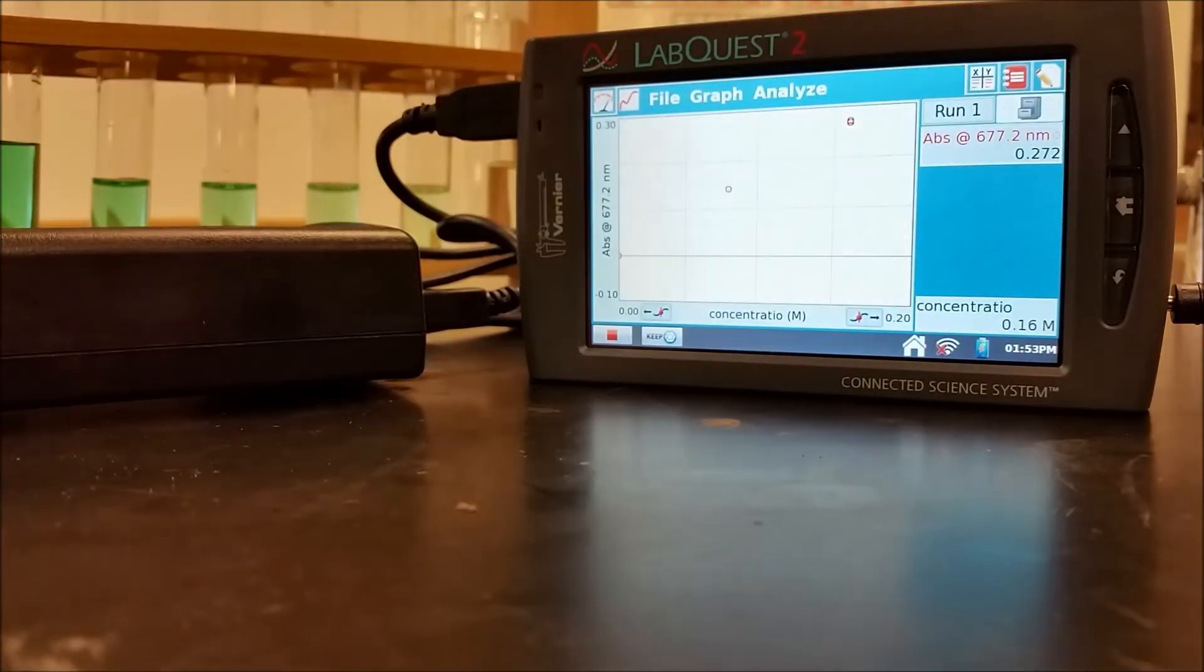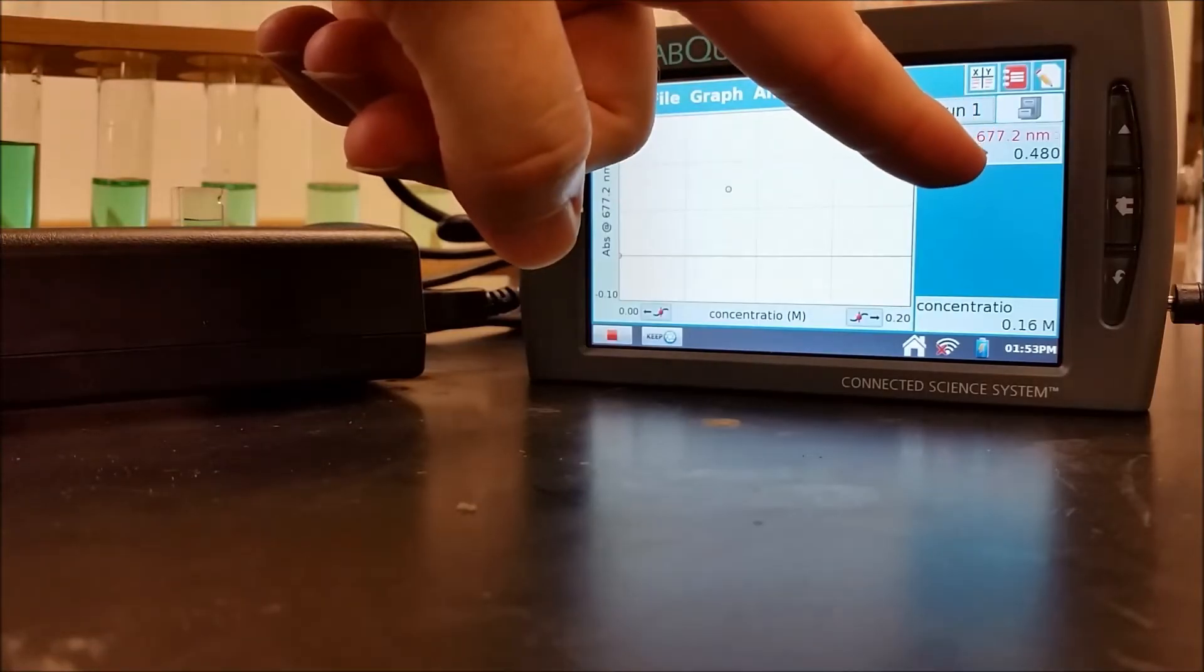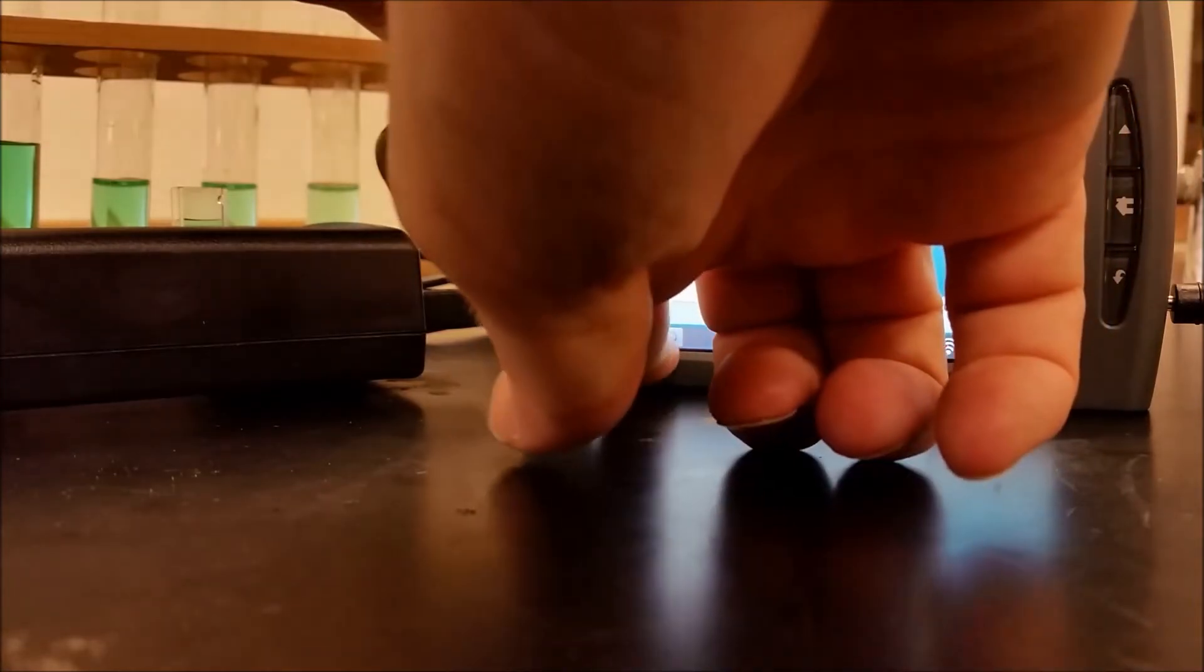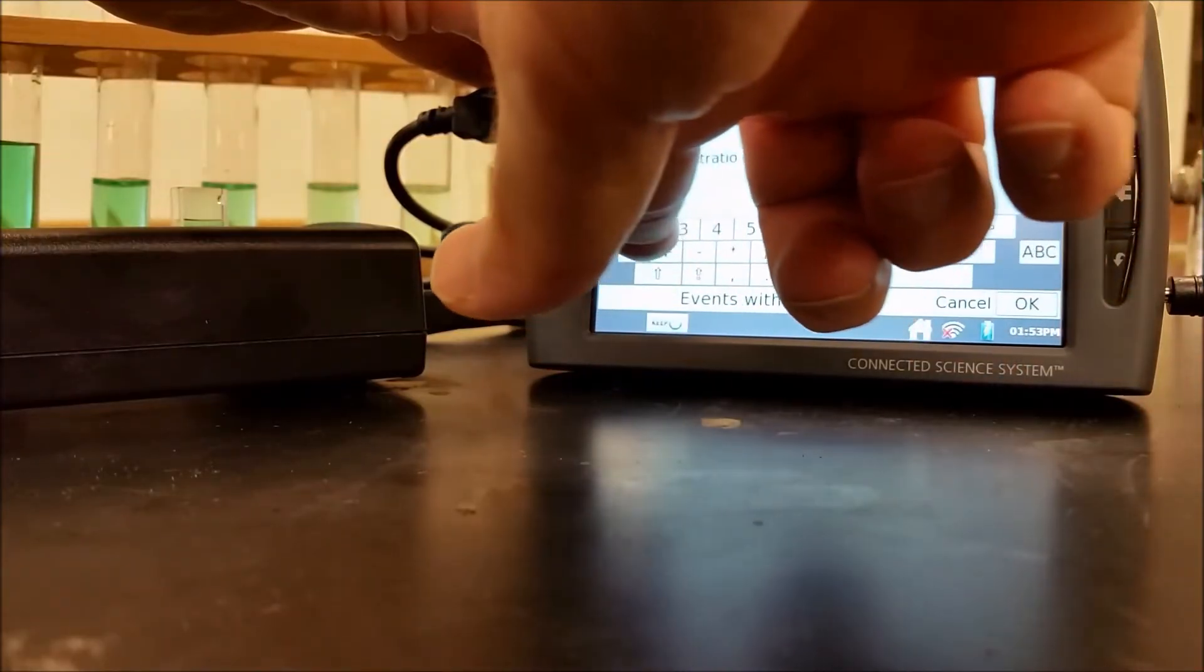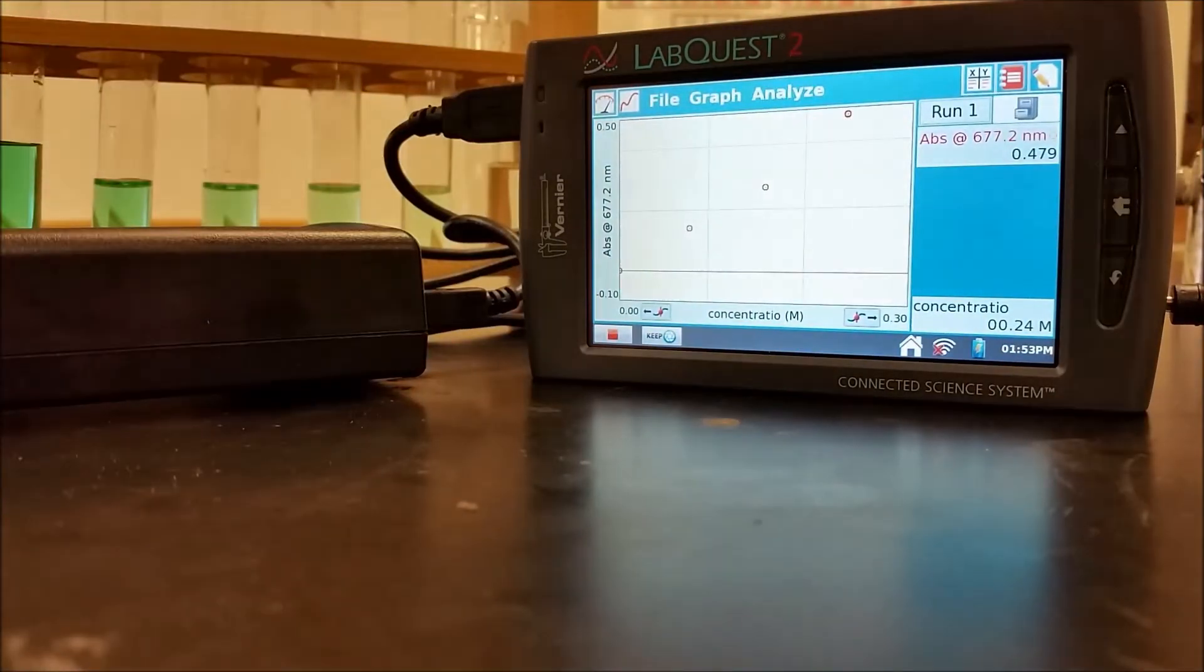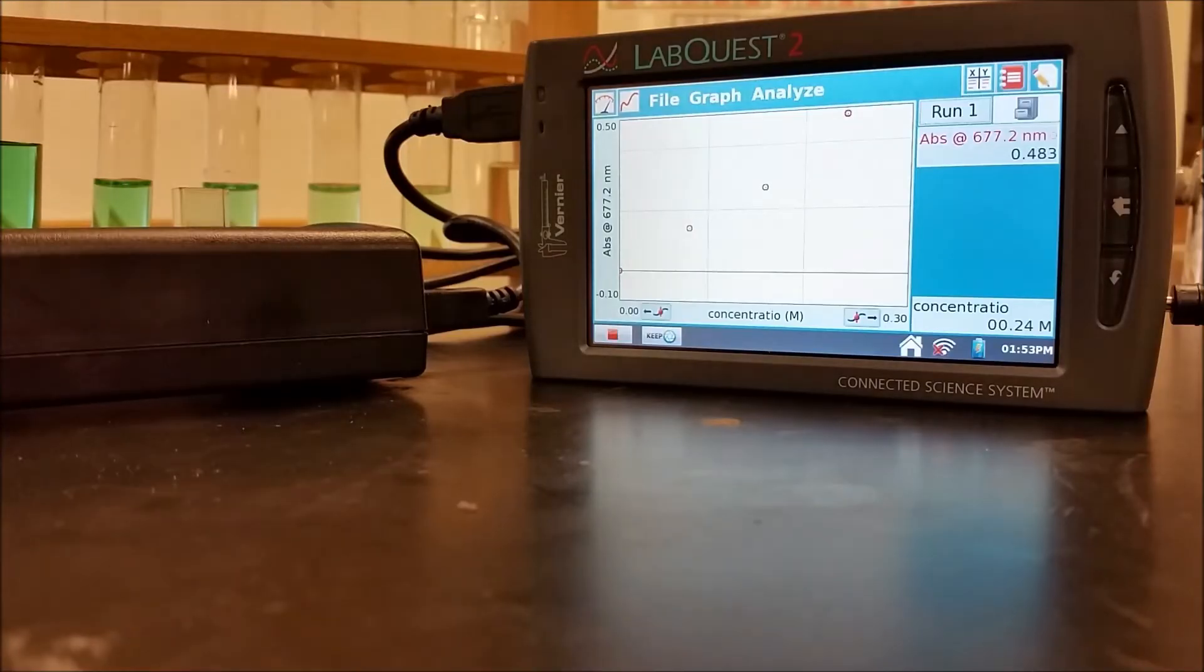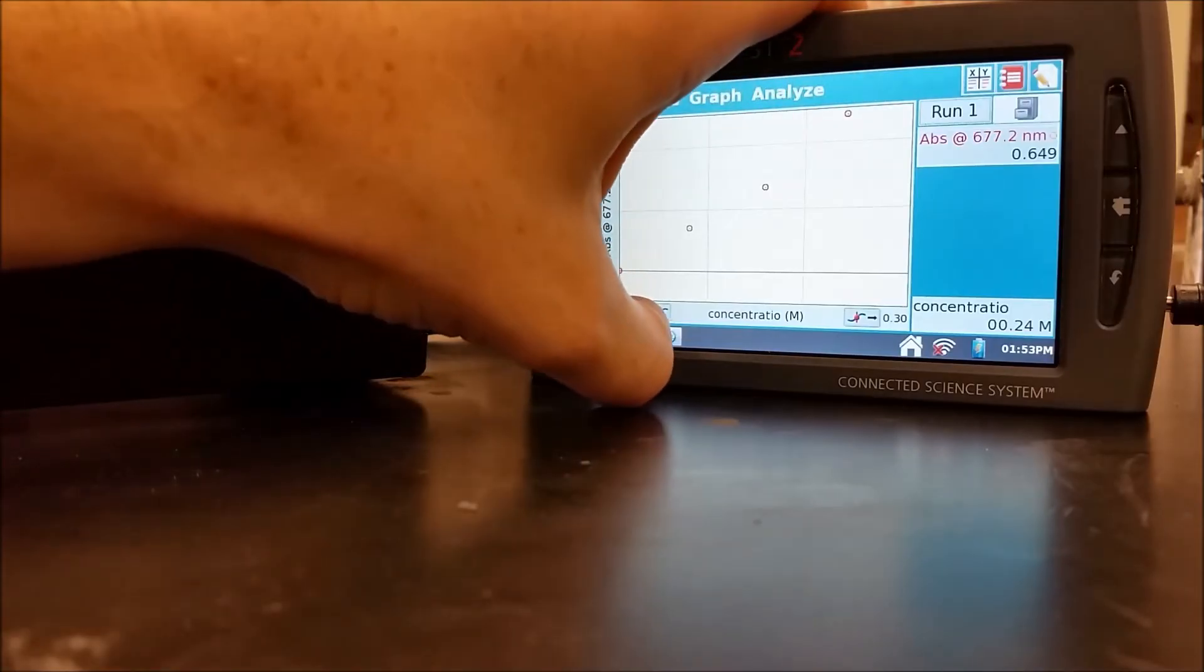I'll take that out. Go to the next one. So again, I want it to stabilize, 0.480. And it looks like it's staying around there. And 0.650, that looks good. Let's keep that.